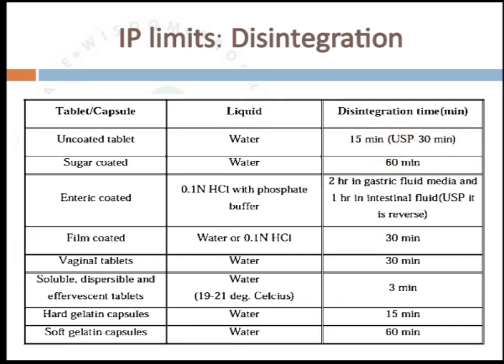For an enteric coated tablet, for the first 2 hours we perform the disintegration test in gastric fluid media, and then 1 hour in intestinal media. So for the first 2 hours it should not disintegrate, and after that in intestinal fluid it should disintegrate. Then a film coated tablet in water or 0.1 N HCl should disintegrate within 30 minutes, and a vaginal tablet in water within 30 minutes. Soluble, dispersible and effervescent tablets in water should disintegrate within 3 minutes, a hard gelatin capsule in water within 15 minutes, and a soft gelatin capsule in water within 60 minutes.